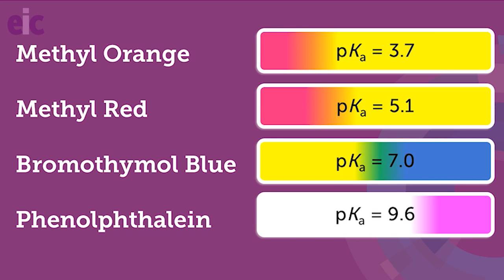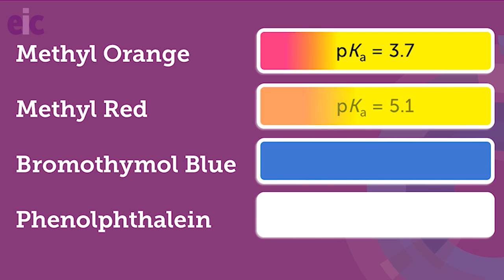At the top of the solution, following the first addition of acid, our pH is somewhere around 8. The phenolphthalein is already colourless, and the other indicators are either yellow or blue, giving us a bluey-green appearance overall. This is of vital importance when it comes to selecting indicators for use in the titration.